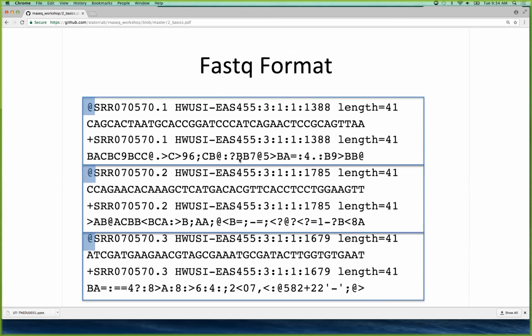I think you can have instrument problems. The way it works is you have a glass slide, and each time a base is added there's fluorescence and a super high resolution camera taking pictures. Sometimes, if you have a low complexity library and let's say 90% of the slide is a G, everything that's not a G will get washed out in the image and you'll get some N's in the middle. It's an instrument error. And a lot of times to avoid that, they'll ask you to spike in something to create more nucleotide diversity.